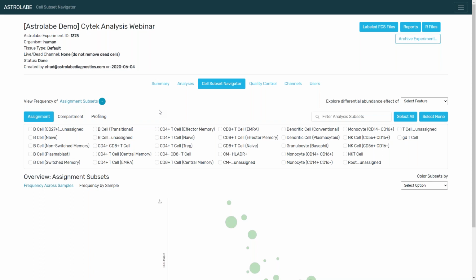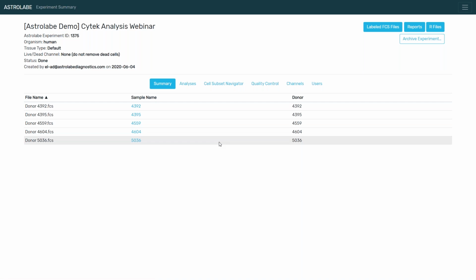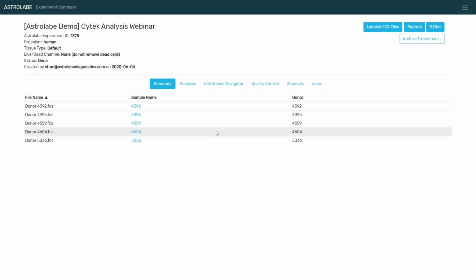Conceptually, this is similar to building a template in FlowJo and then moving that template around for each one of your FCS files. The second mechanism by which you can incorporate batch effects is you can explicitly analyze for them. You can include a column here called batch, and then all of the statistical analyses will be done over the different batches. And if there is something that differs between batches, you will know to eliminate it from the analysis of other experimental conditions.